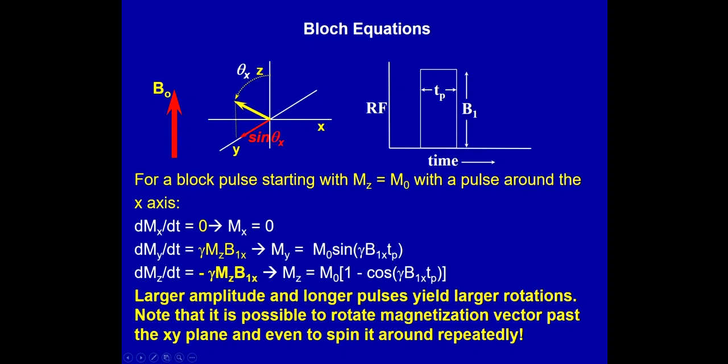Go down to 90 degrees. If you go past 90 degrees, you begin to redevelop magnetization in Z, and you start to lose it along the XY plane. So we were taking Z magnetization, converting it to Y magnetization, and then moving it back to Z. So note that just because you apply more B1, it doesn't necessarily get you more signal.